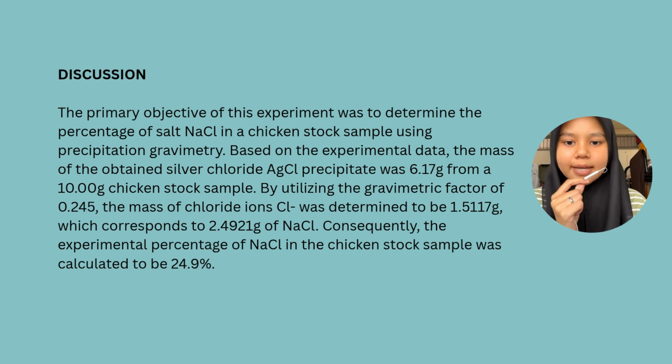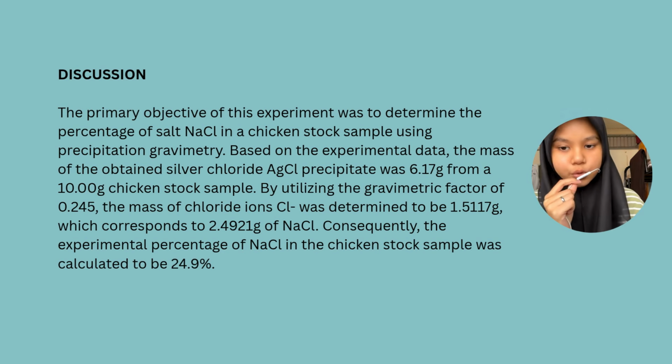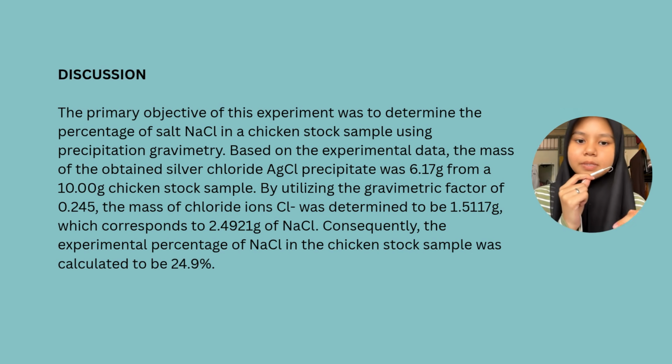We determined that our sample contained 1.5117 grams of chloride ions, which translates to 2.4921 grams of pure sodium chloride. Ultimately, this gives us an experimental salt percentage of 24.9%.